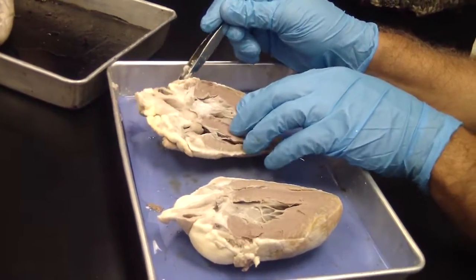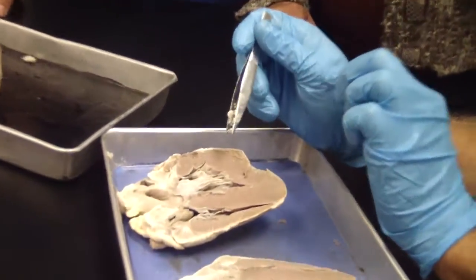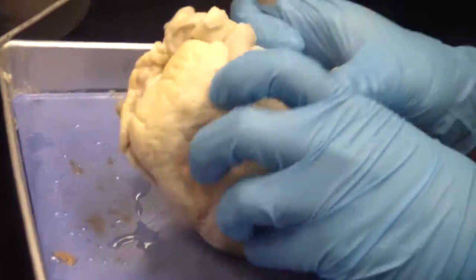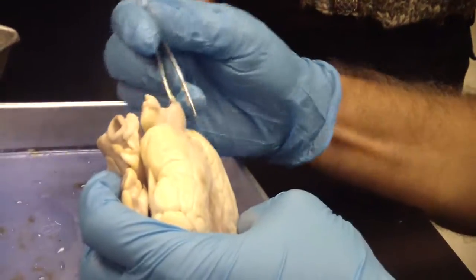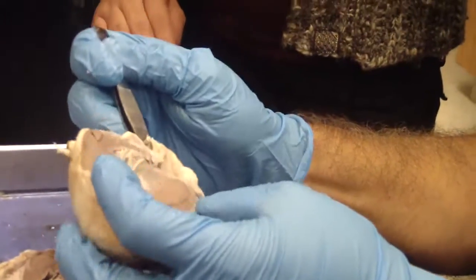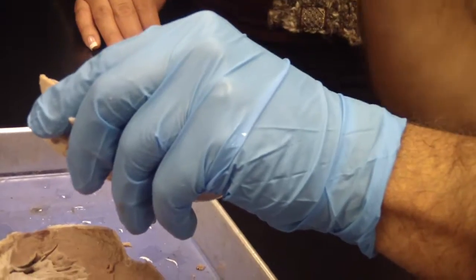In order to see the semilunar valves, from the right, remember, here's the right ventricle, that's the pulmonary trunk. See that? I don't want to do that, you have to cut all of this, so that way we can see the pulmonic semilunar valve.